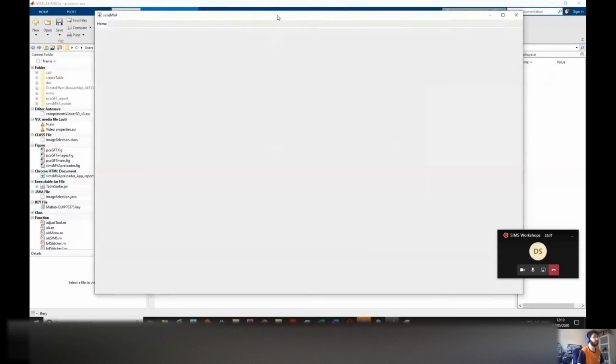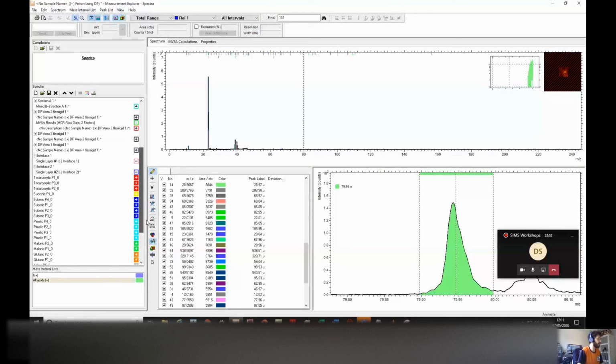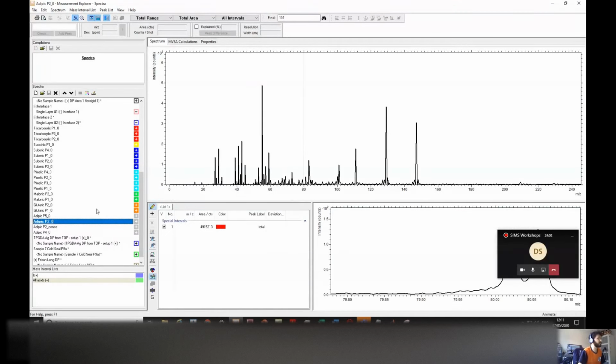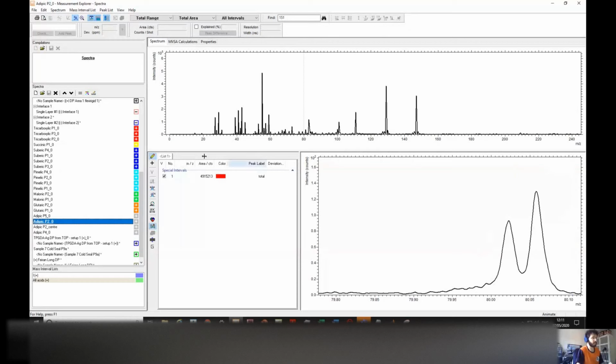Okay. So now, before we start using simsMVA, let's go back to Surface Lab and see how to export dataset for each of the examples. Right. So the first one, as I say, it's spectra. And I decided to use these carboxylic acids, like we had in one of these slides last week. So basically, these are just repeat spectra of several carboxylic acids, and we want to use MVA to find differences between these spectra. So the first thing to do is, remember, you need to pick variables, right? So basically select the peaks.